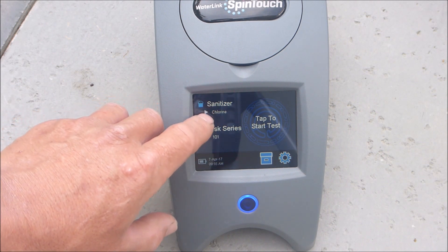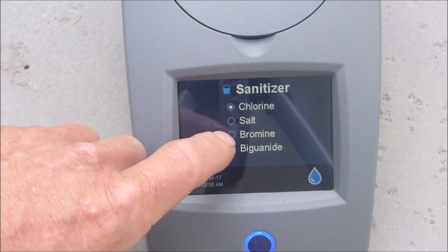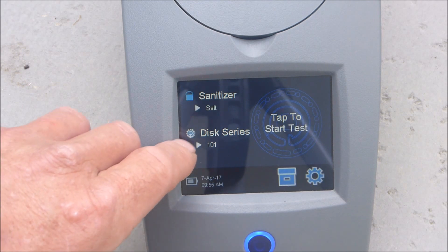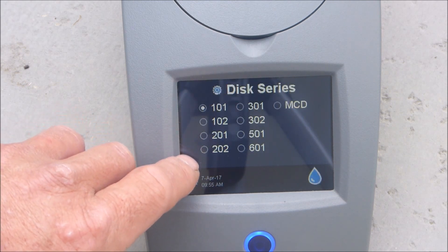Then you have to pick the sanitizer. This particular pool is actually a salt pool, so I'm going to pick salt. If you're doing a spa, you can hit bromine. This series is 202. Once you put the disc series in, it will remember it.